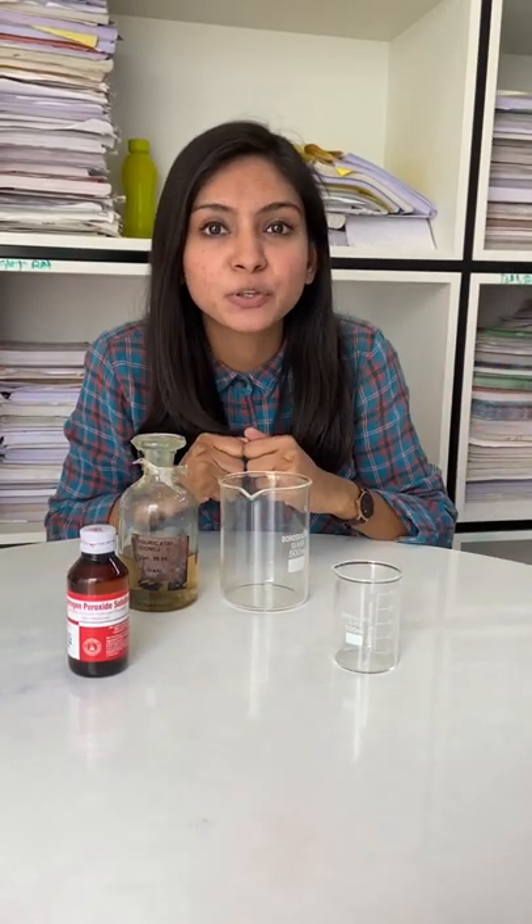Today I am going to make Piranha Solution, which can digest in seconds. Let's see how it will be.